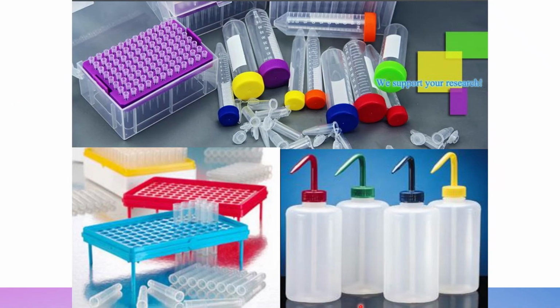Next are plasticware. Plasticware is beginning to replace glassware in the laboratory setting. The unique high resistance to corrosion and breakage, as well as varying flexibility, has made plasticware most appealing. It's relatively inexpensive. It also allows most items to be completely disposable after each use.